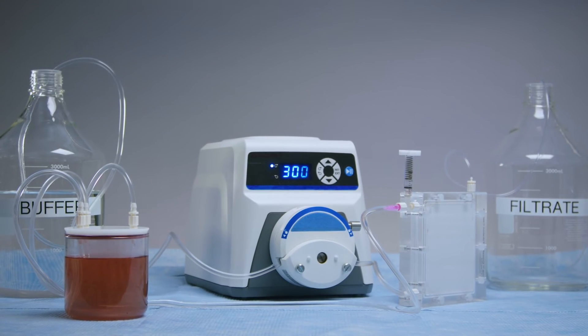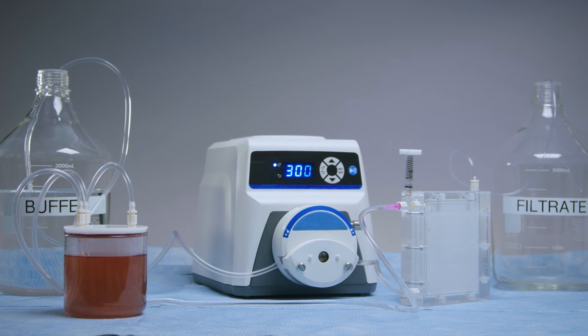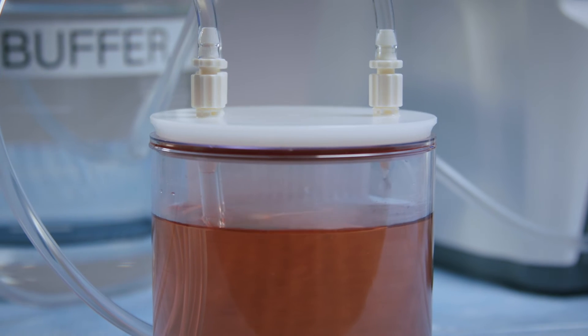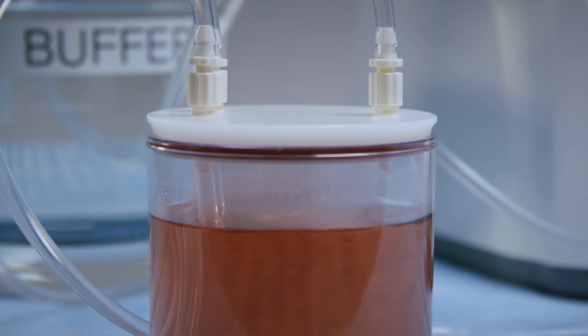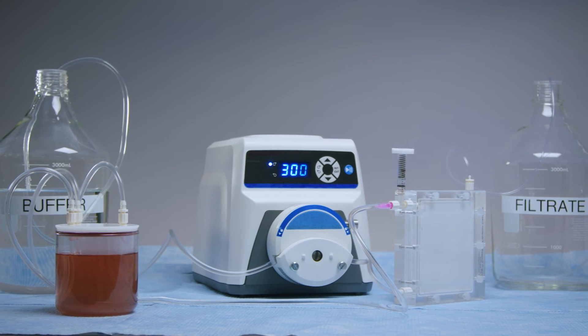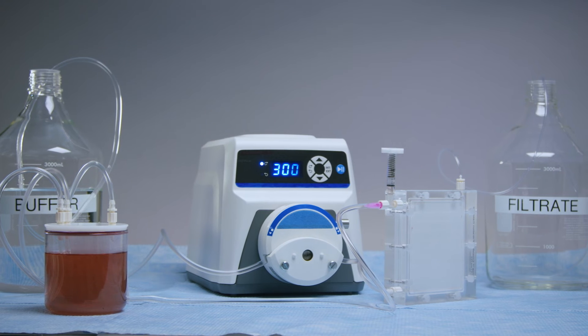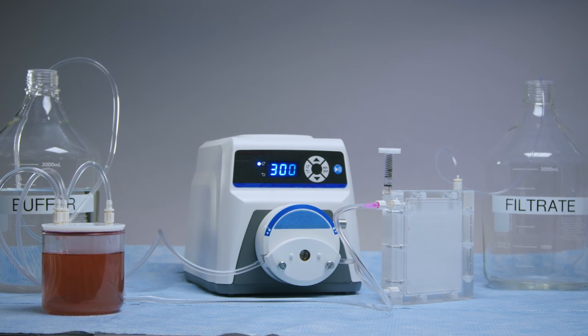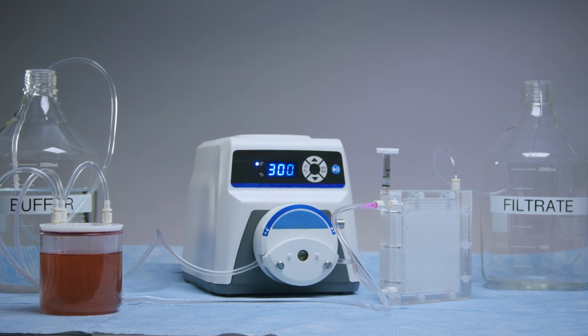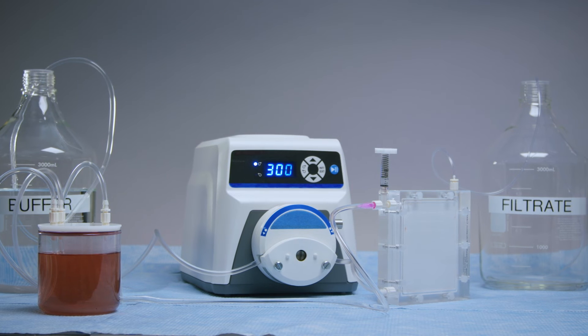Lastly, this versatile cassette can be used to buffer exchange your sample. A diafiltration reservoir is required for this function. An exchange buffer 5 times larger than the sample volume is used to achieve 97% exchange efficiency. After buffer exchange is complete, your sample can be concentrated for the next step in your experiment workflow.